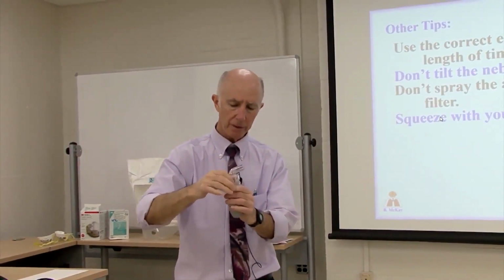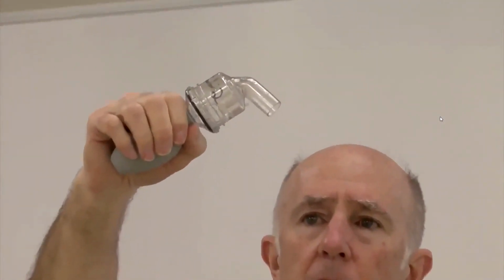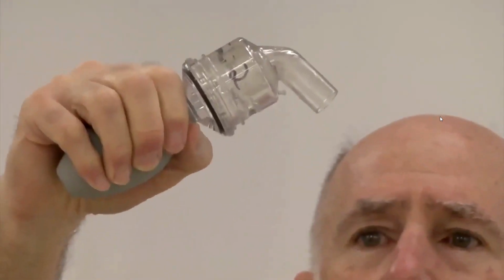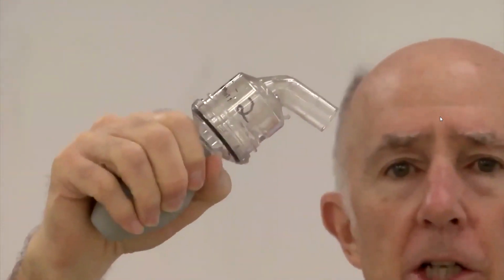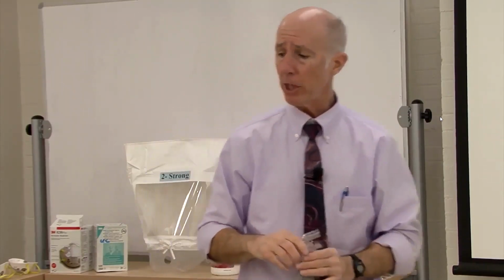And you will not be able to see this, but when you get the kit, you can look at it yourself. If I tilt the nebulizer excessively, now when I squeeze it, it doesn't pick up the liquid. You cannot generate the aerosol. If you don't generate aerosol, you have no challenge. If you have no challenge to that facepiece seal, then potentially a respirator that does not fit well may pass if you don't deliver the challenge agent.